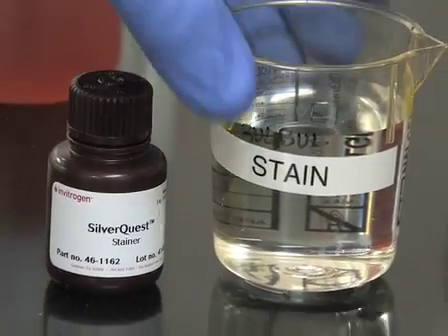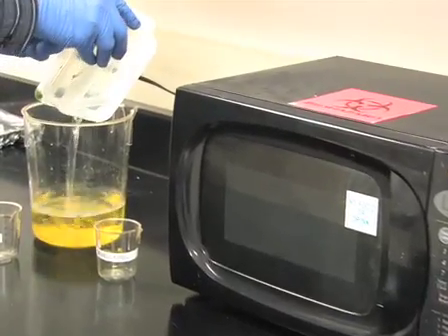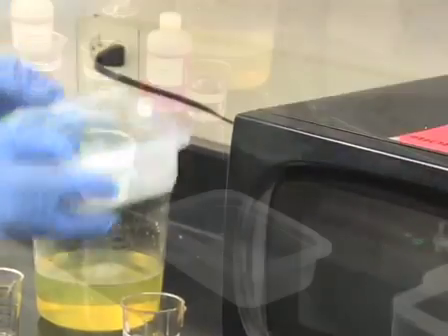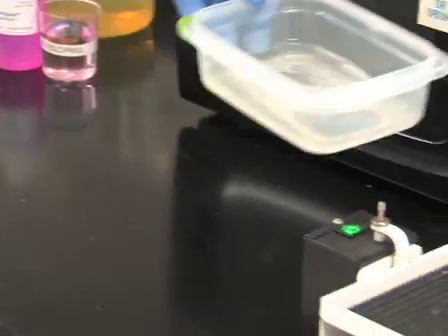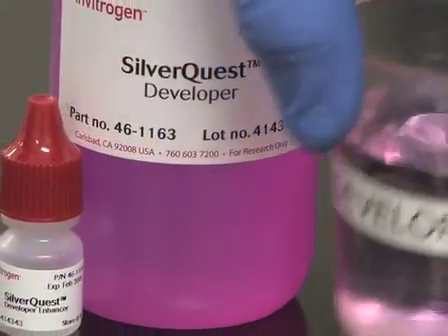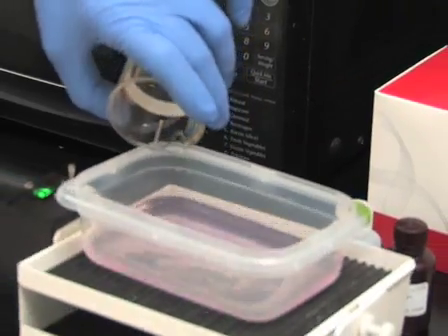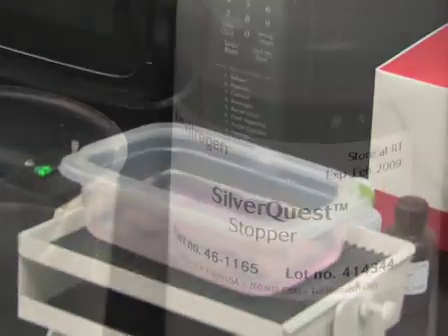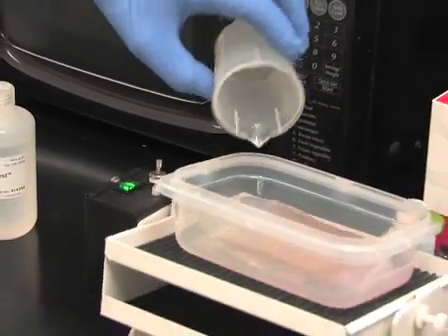Now add 100ml of staining solution. Microwave for 30 seconds and slowly agitate for 5 minutes. After 5 minutes, pour off the staining solution. Add 100ml reagent-grade water, skip the microwave step, and place directly on a shaker for 20 to 60 seconds. Discard the water and immediately add 100ml of developing solution and develop until protein bands become visible with the background remaining clear. This will take approximately 5 to 10 minutes. At this point, add 10ml of stopper solution to the developer to arrest the development.